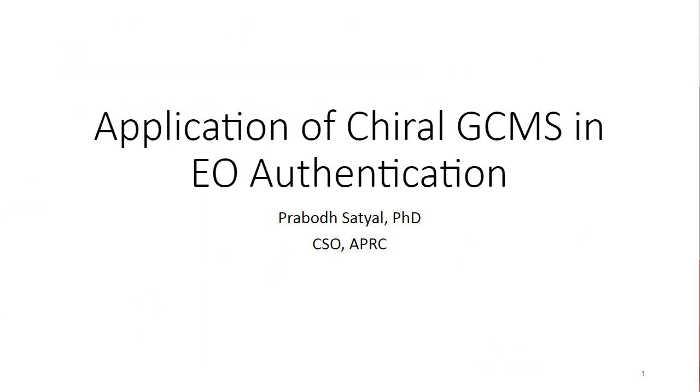Today, I'm going to present application of chiral GCMS for authentication of essential oils. I will be mostly talking about single quadrupole mass spectrometer. However, there are several advanced chromatographic techniques in use, which I'm not going to discuss today. And most of the time, I'm talking about essential oil, and I could say oil instead of essential oil.